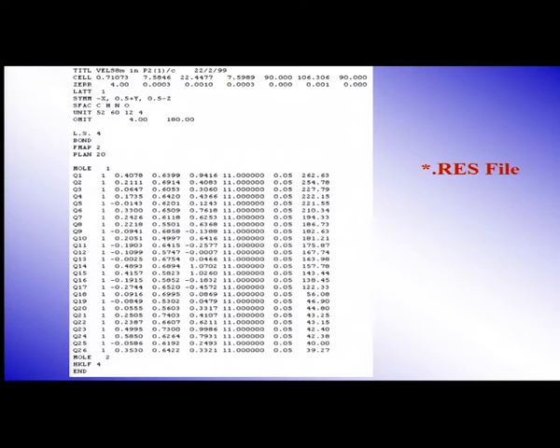Sometimes we refine the occupancy; refine means adjustment of the parameter. Now, the program is ready for refinement. So, adjusting the positions and the thermal parameters slightly to get a better fit between the structure factor you are going to calculate out of this structure and the structure factor amplitude you already have from your experimental data. So, this is what they are telling. I will give approximate positions, and go to reality by assuming physical atoms and also thermal vibration.